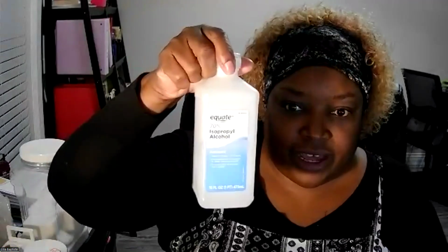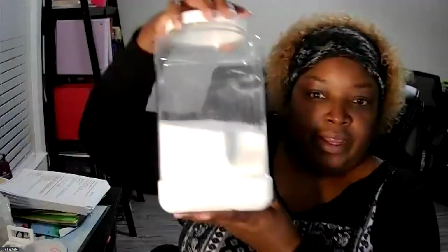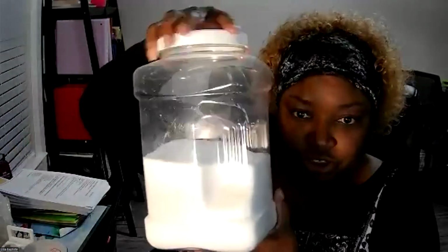And then you have your isopropyl alcohol. Okay, just your rubbing alcohol. And then mineral oil. Okay, got mineral oil. And then table sugar. This is my big container of table sugar. All right. So those are what you're going to need for this lab.